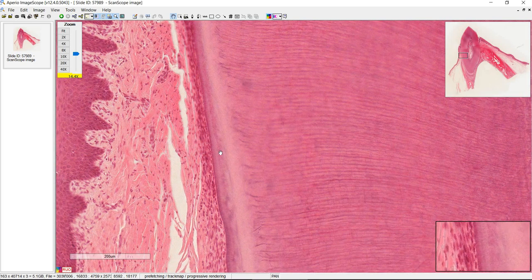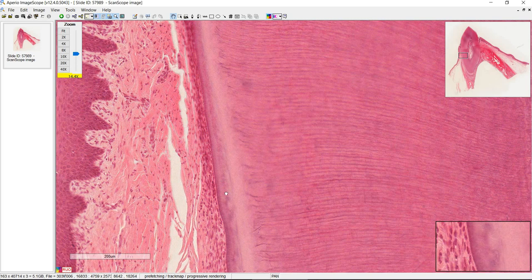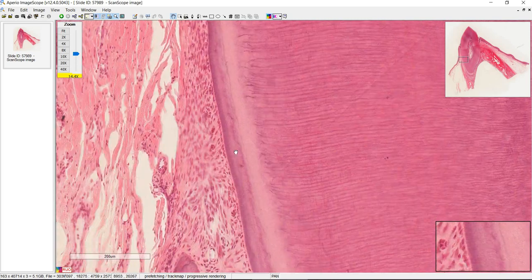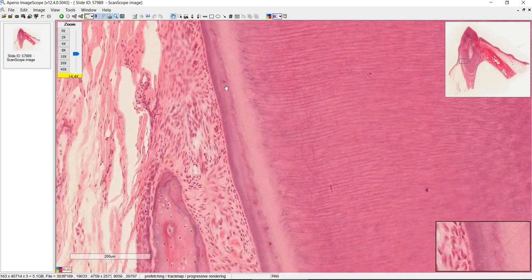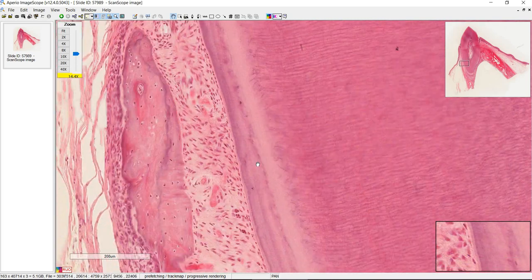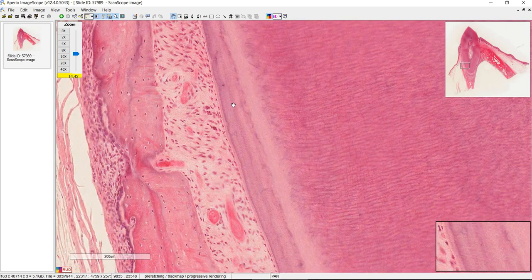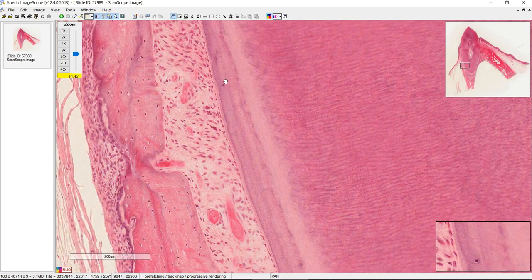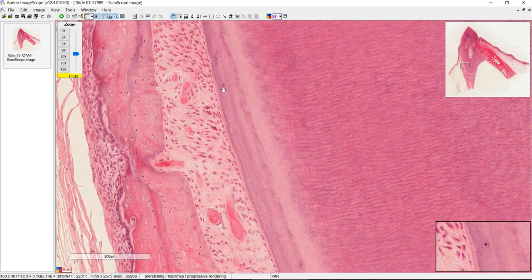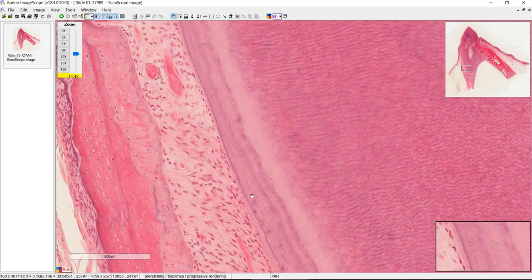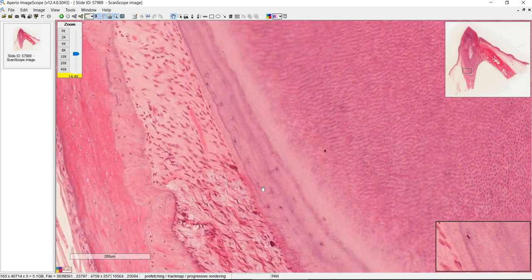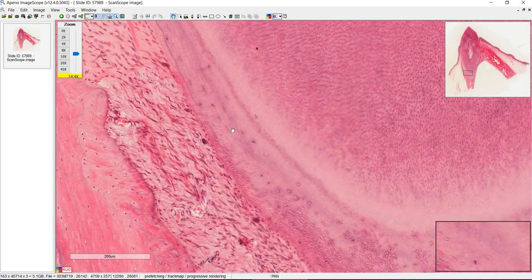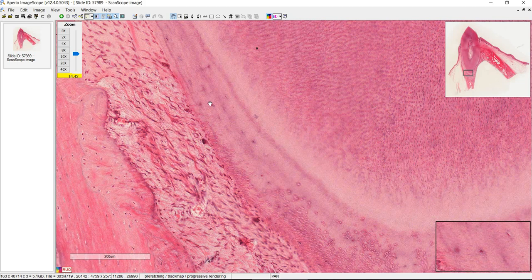After the dentin we have cementum which is similar to bone and it's really thin up there but if you follow this further down you'll see it's a lot thicker. This is a cementocyte. Here you have more cementum and more cementocytes over here.